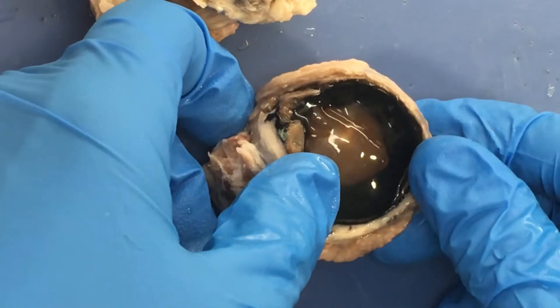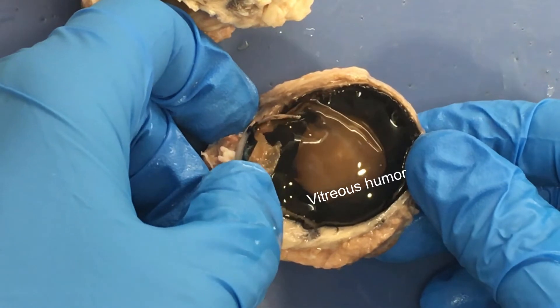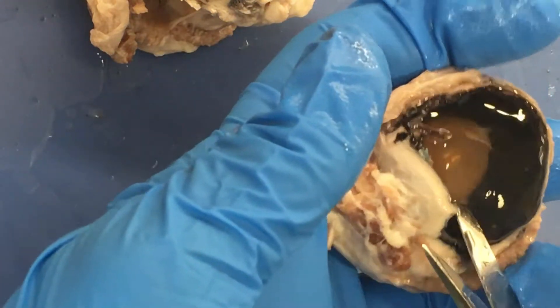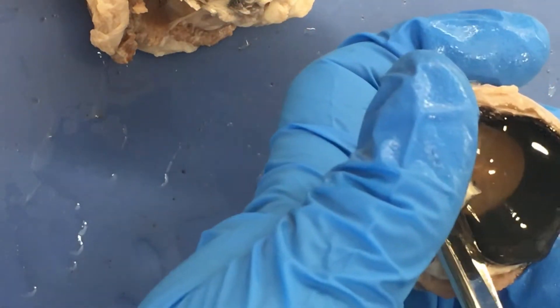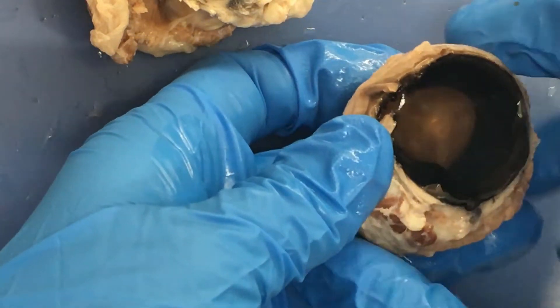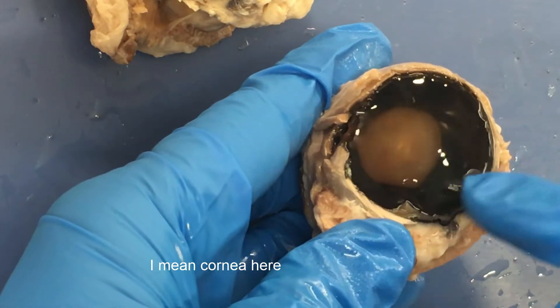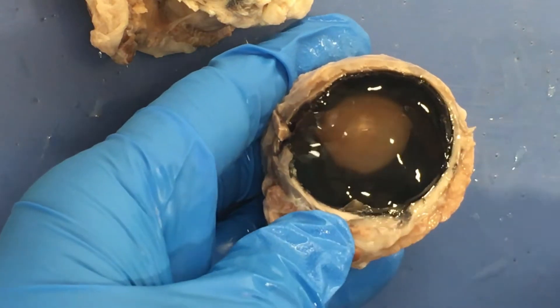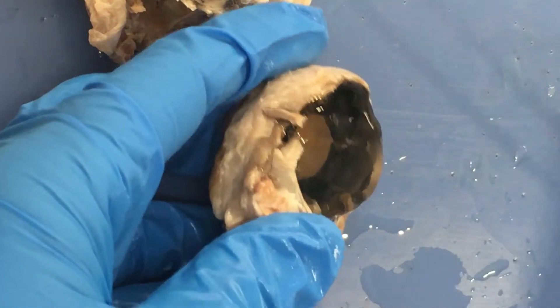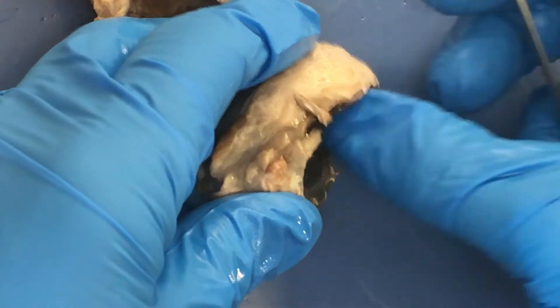That gel-like material is the vitreous humor, and the vitreous humor is kind of in the way for us being able to see other stuff, so you have to invariably get rid of it. I'm just going to trim this piece off. We're looking at the side towards the retina, and you can see that gel-like material, and then you can see that circle inside — that's the lens.